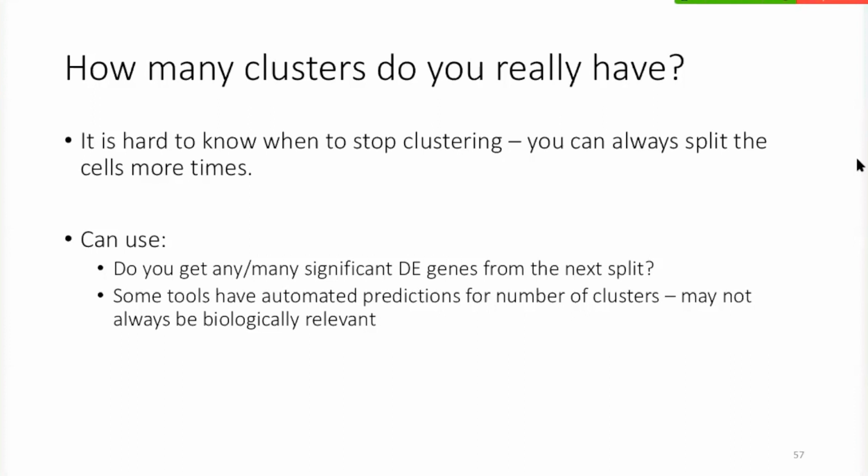A very common way is to look at differentially expressed genes. So if you define a cluster, then compared to other clusters, are the differentially expressed genes meaningful? Do they make sense or not?